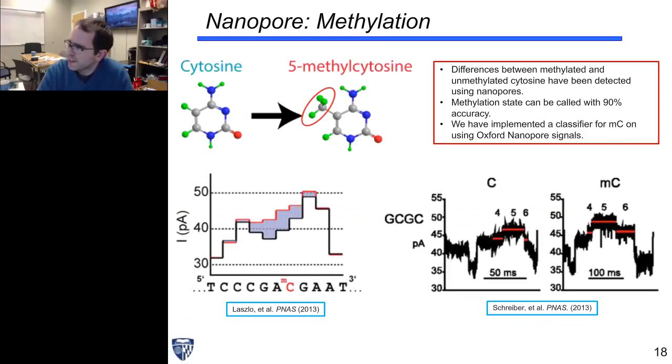So can we look at DNA methylation with nanopore sequencing? Well, two groups showed that you in fact could back in 2013. Jens Gundlach's group and Mark Akeson's group demonstrated that with research pores, not with the nanopore we use today, you were able to see changes in current evolving over time from a methylated cytosine versus an unmethylated cytosine.